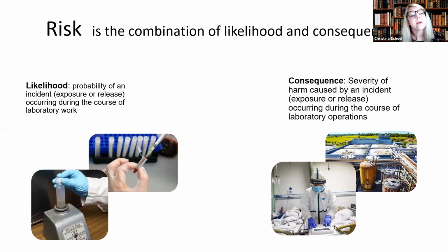And so a shorter definition of risk is the combination of likelihood and consequence, where likelihood is the probability of an incident, exposure or release that can occur during the course of laboratory work. Consequence is the severity of harm caused by an incident occurring during the course of laboratory operations.